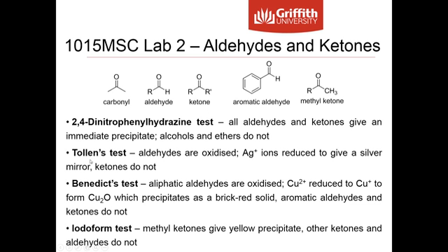The second test there is the Tollens test. In this one, aldehydes are oxidized, and silver ions are reduced to give a silver mirror. So the presence of a silver mirror is a positive result in that test, and that would indicate that the molecule contains an aldehyde.